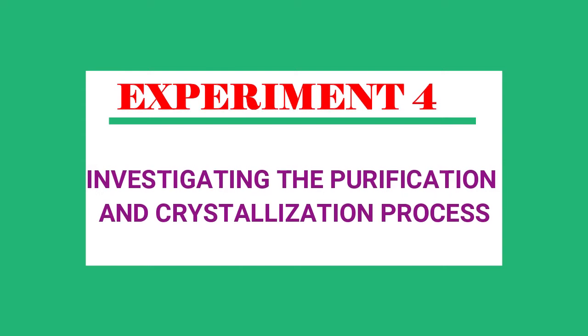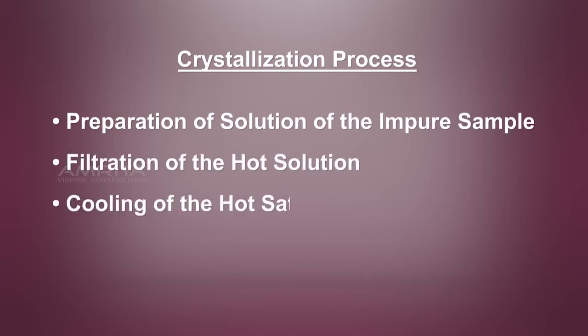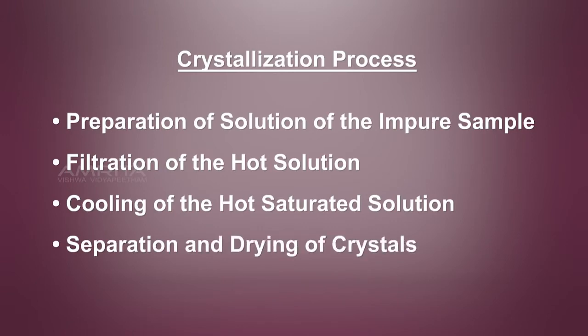Hi guys, today we're going to do experiment 4. We are going to learn purification and crystallization process. The crystallization process involves preparation of solution of the impure sample, filtration of the hot solution, cooling of the hot saturated solution, separation and drying of crystals.